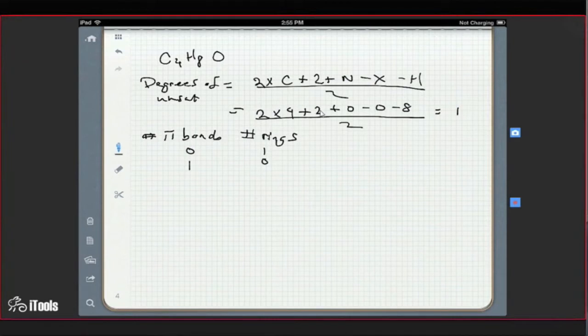There's a carbonyl stretch, so we know that the O is for a carbonyl. And then the NMR spectrum gives us 3 peaks, but there are 4 carbons. So we know that one of the carbons doesn't have any H's. And it's probably the one attached to the carbonyl, because if that had 2 H's, then there wouldn't be anything left in the compound.